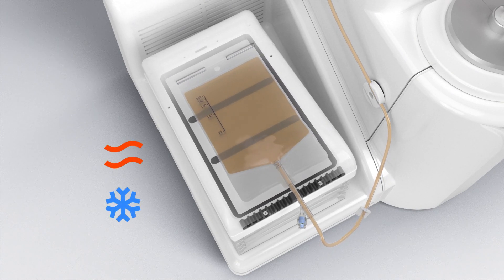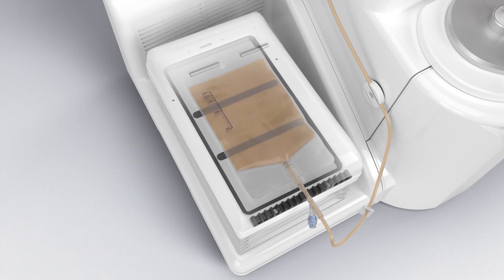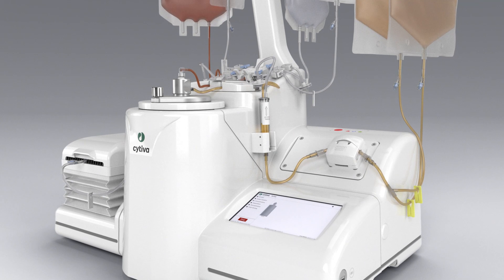Cryo protectant or other dilution solutions can be added under temperature control while mixing for homogenization, before splitting the product into doses.